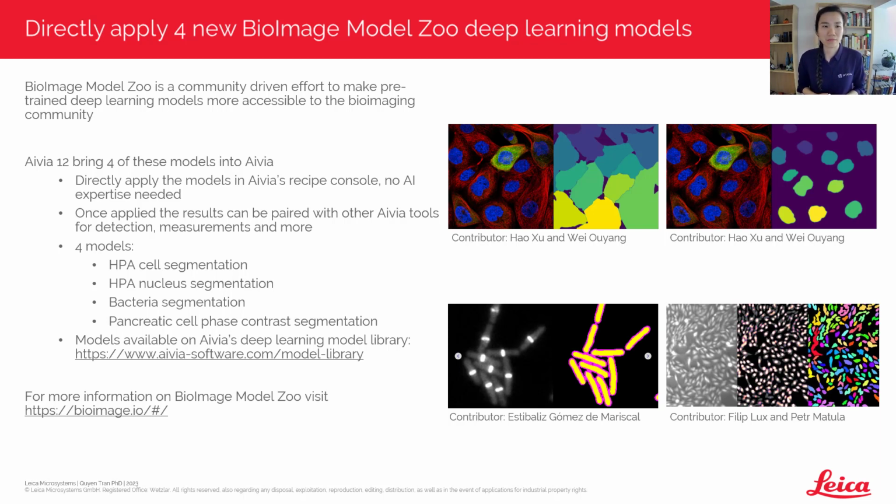We want to express our thanks to the organizers and leaders of the Bioimage Model Zoo in making deep learning easier for the scientific community to use. We also want to send a special thank you to the contributors of these 4 particular models that we've incorporated into Aivia. You can, of course, find out more information on the Bioimage Model Zoo on their website, which I've included here. I've included a link here for you.